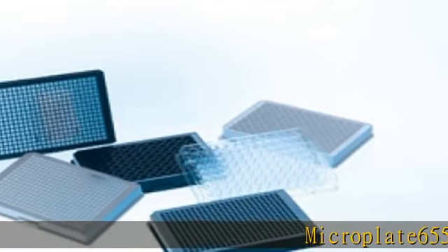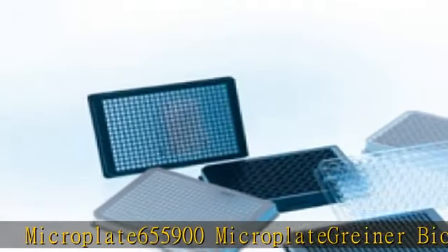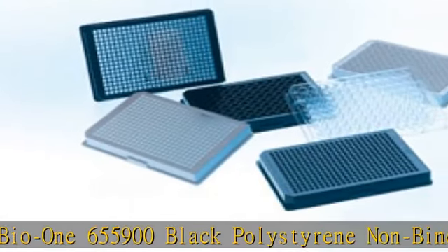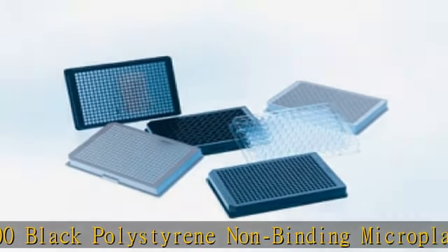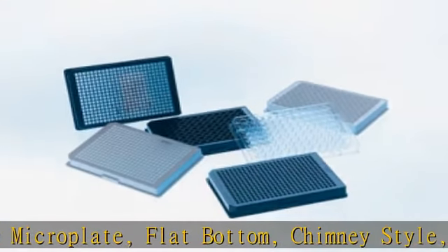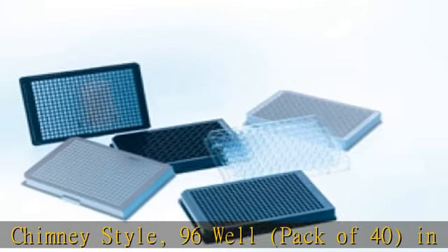Microplate 655900 — Greiner Bio-One 655900 Black Polystyrene Non-Binding Microplate, Flat Bottom, Chimney Style, 96 Well, Pack of 40. Check the description to get this product today at the best price.